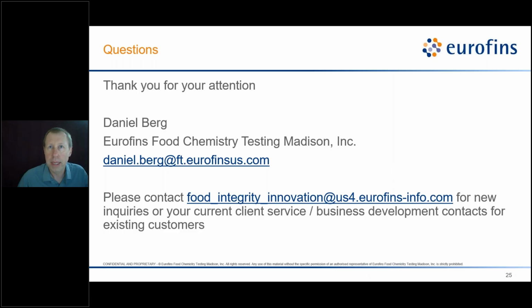Again, this is dependent on the amino acids being GRAS, generally recognized as safe, allowed ingredients to add. And then for the PDCAAS, we would be measuring the crude protein, and the amino acids that have been added to the product and declared within the ingredient statement would contribute to the final amino acid score and make an improvement. Okay, great, thank you.